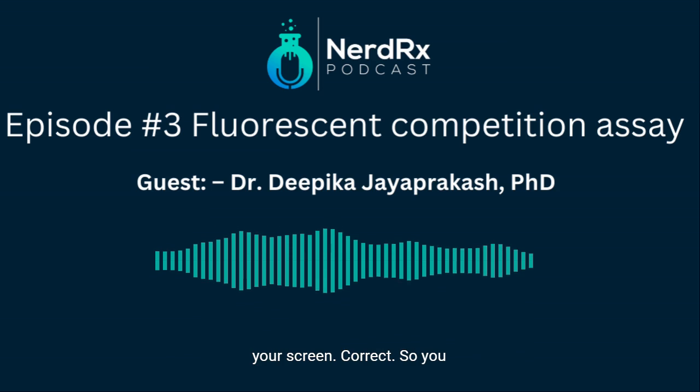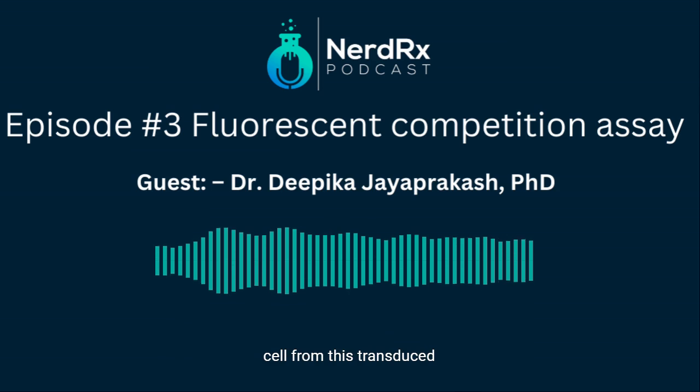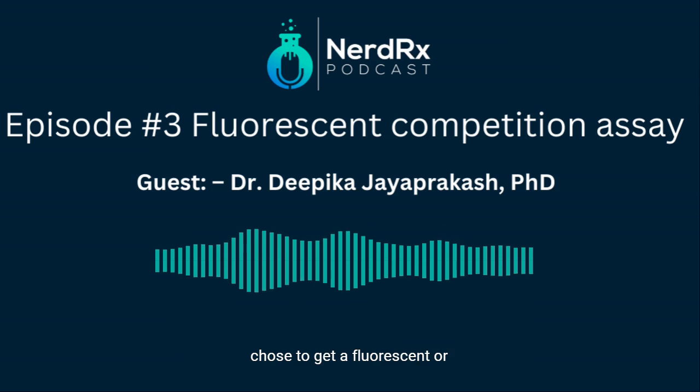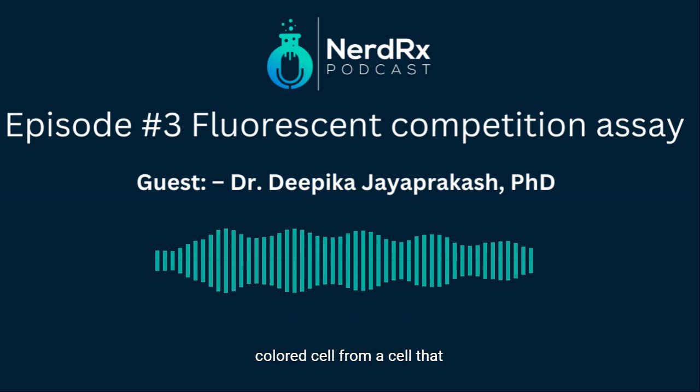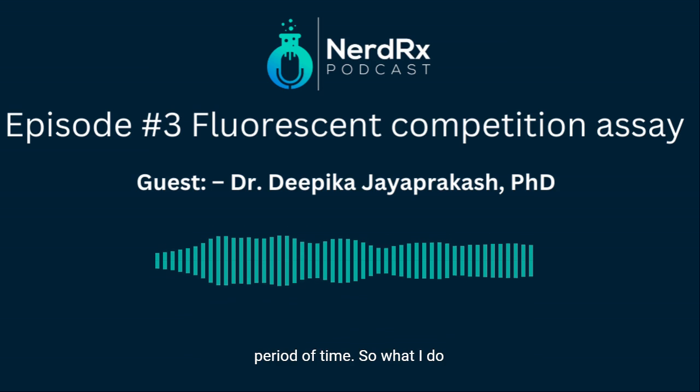You can either generate a colored cell from this transduced cell, or you can generate a fluorescent cell from a cell which doesn't have this gene knockout, which is on its own. I chose to get a fluorescent cell from a cell that doesn't have the deletion, so that I keep the other one constant, or non-colored, and I mix both cells and culture them over a period of time.